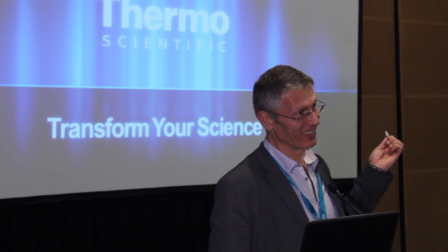Haroon, you have a question? You touched a little bit on some of the antibiotic assays. Do you have software for those assays? You showed measurement of some of the antibiotics, and the linearity looks very good. So following on from that, it should be possible to convert these into very sensitive assays that we could use in the hospital. Is this something you plan to do? I don't know that we're going to commercialize assays for antibiotics, but I don't know that we will or won't, is the honest answer. But this is of huge interest, of course? Yes, for microbiology, absolutely.